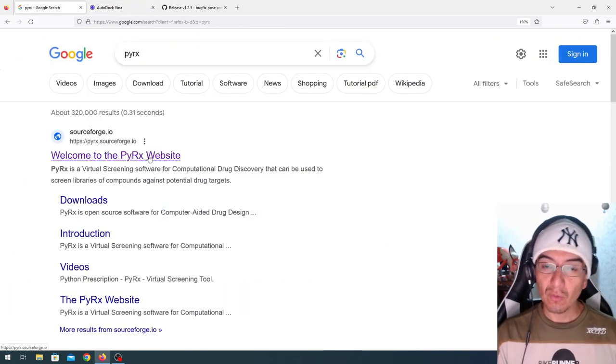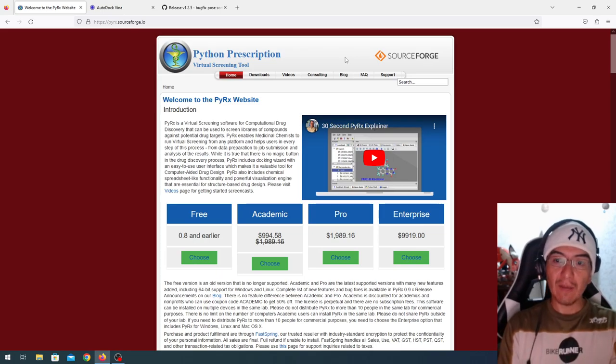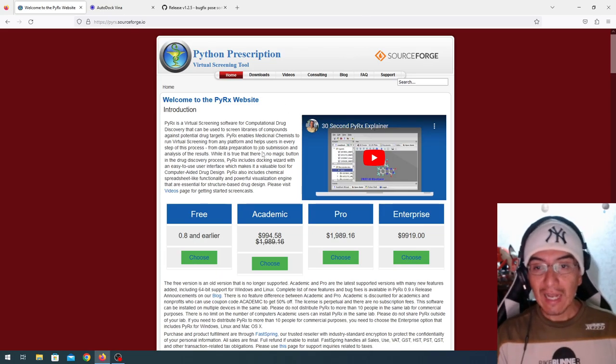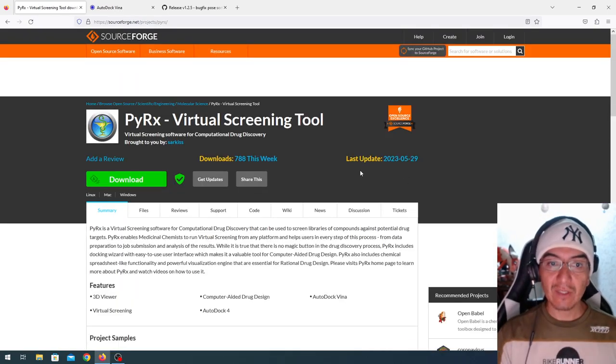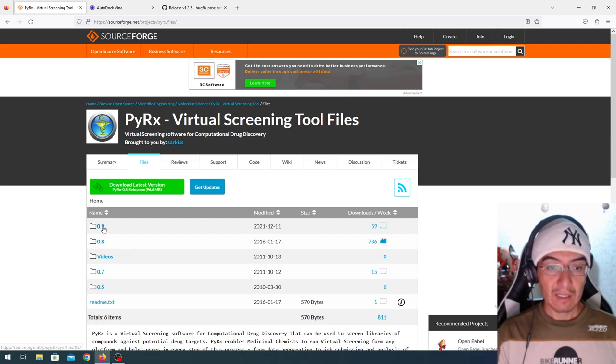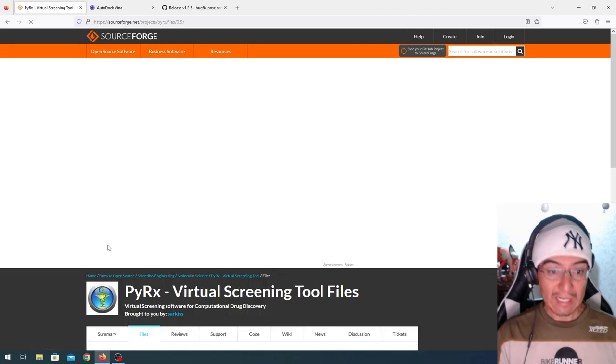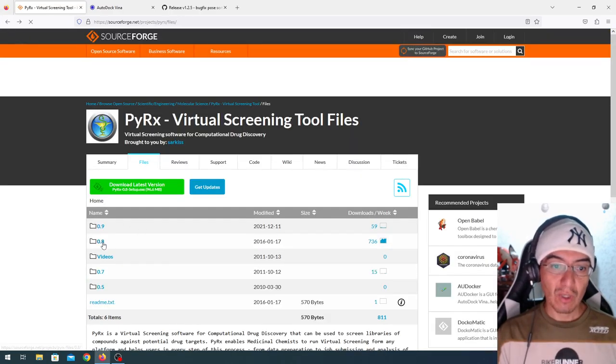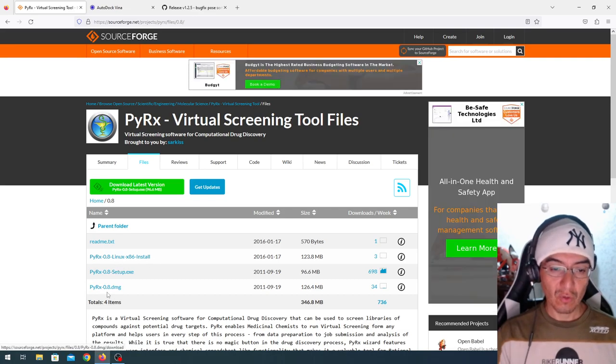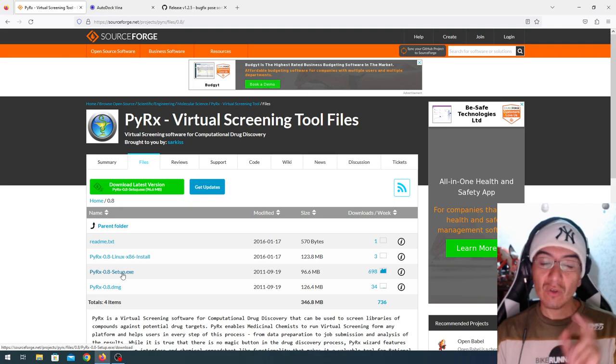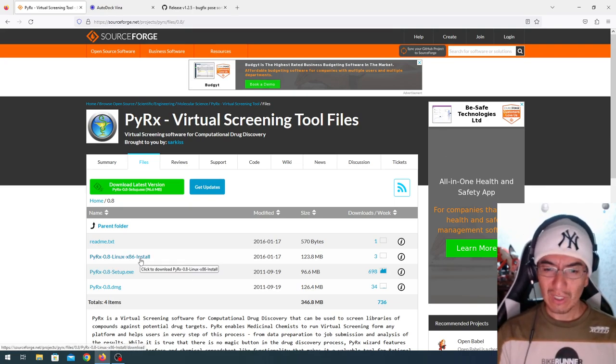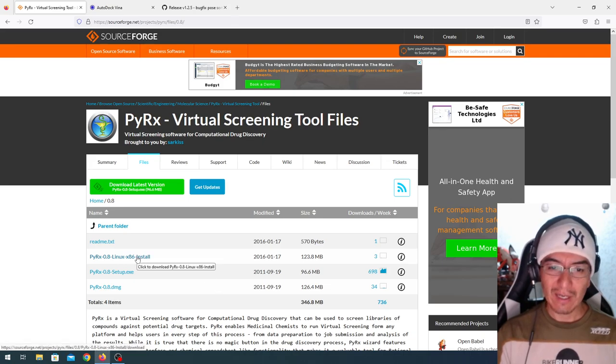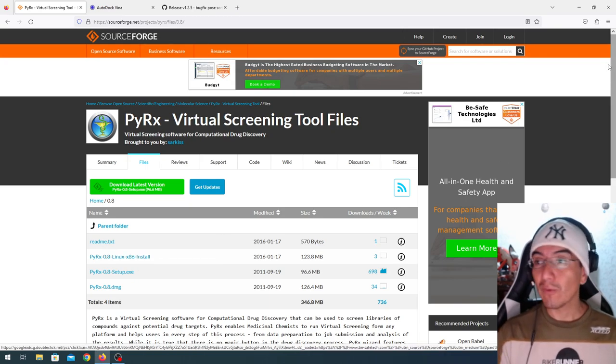For that, I want to direct you to PyRx. PyRx, or Python Prescription, is a graphical interface to Vina and AutoDock that allows you to run docking in a very efficient manner. So here on this page, you can go to files, and you can get 0.9 version for Linux, but 0.8 is available for Linux, Windows, and Mac. Mac up to Mojave, Windows 10 and 11, and Linux. I think it should work on anything that supports x86 code. So, knock yourselves out.